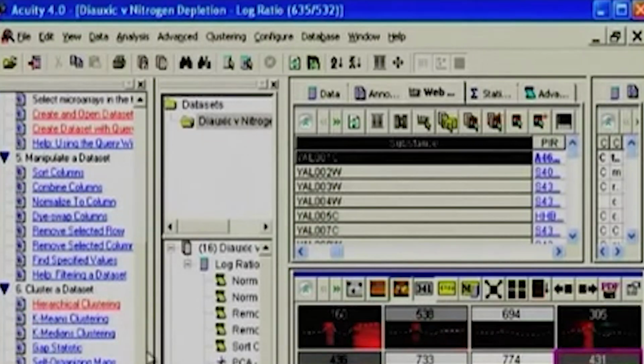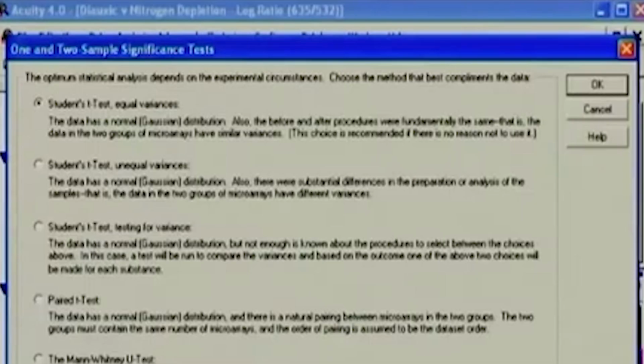Statistics in the sense, if you click on any of the ones which is like a statistical significance test, it tells you I have different options to go ahead with. Different types of tests one can perform, like the student t-test, and the reason is when it is equal variance with a Gaussian normal bell-shaped curve, you prefer this test. When the variance is not equal, you want to go with the second type, where there is a small modification of the student t-test but without equal variance.